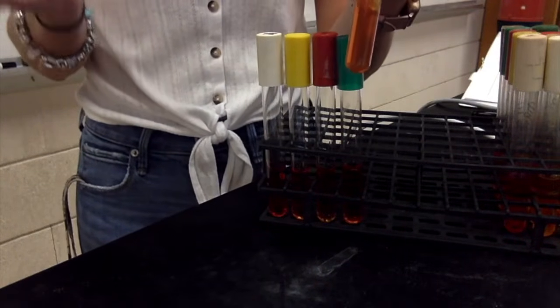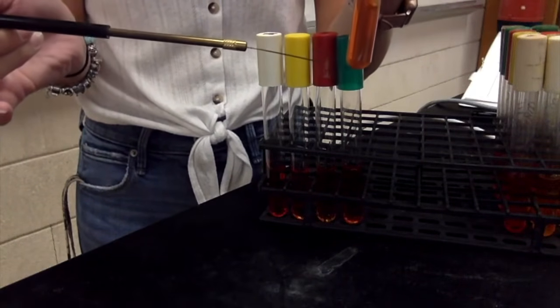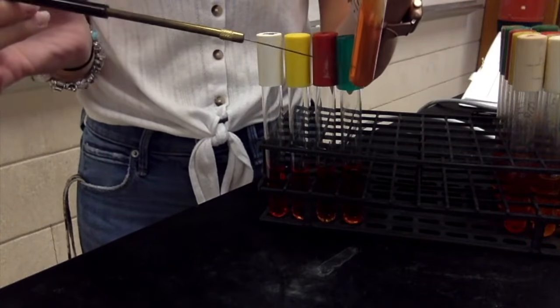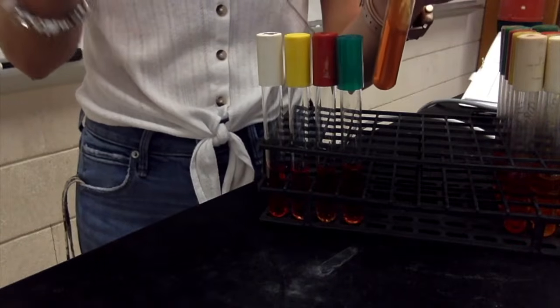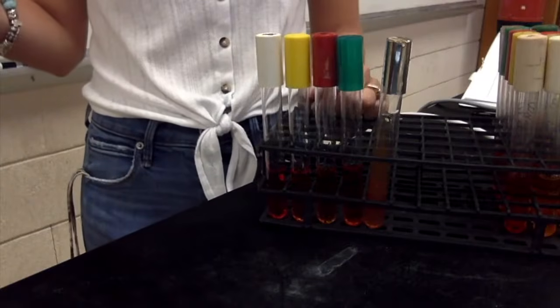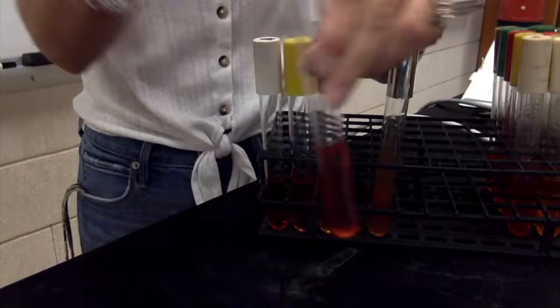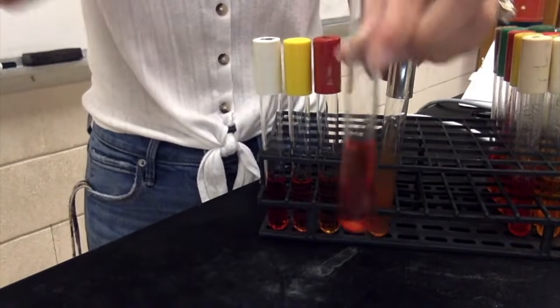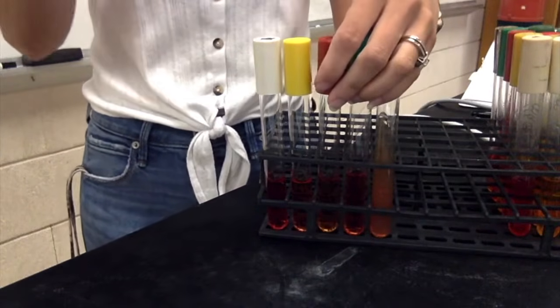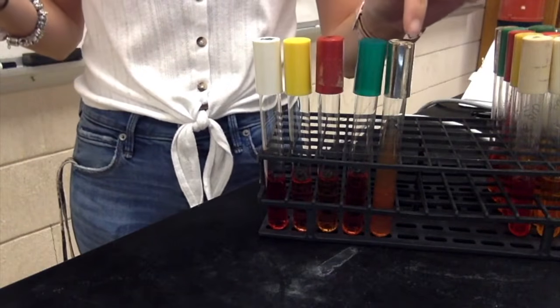You want to make sure to inoculate the entire tube all the way down to the bottom. Because remember, we're reading slant over butt. So if you don't stab all the way down into the bottom of the tube, you're not going to get the bacteria all the way down there, and it can potentially mess up your results. I would flame my loop again, go in and get more bacteria. Now, for the liquid tubes, all you do is dip and swirl. Flame my loop again, go in and get more bacteria, and I would do that for every single tube. And of course, I would have a bacteria per row.